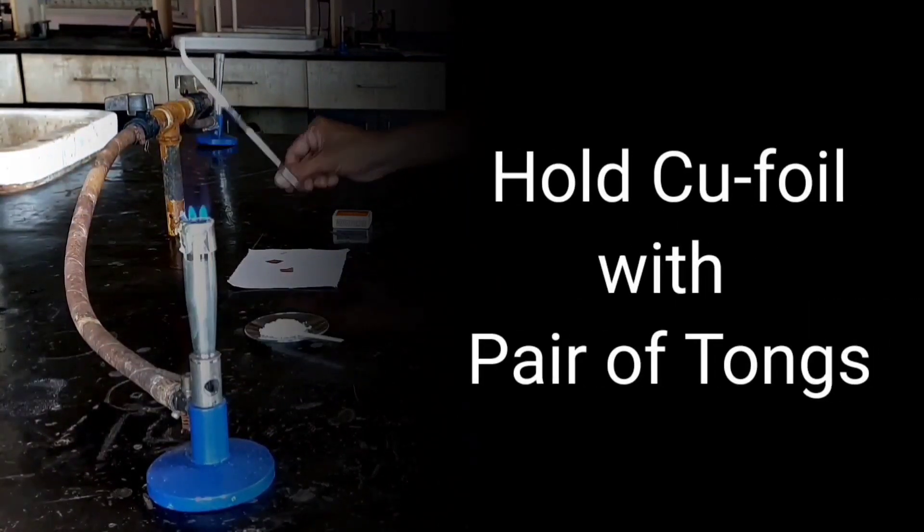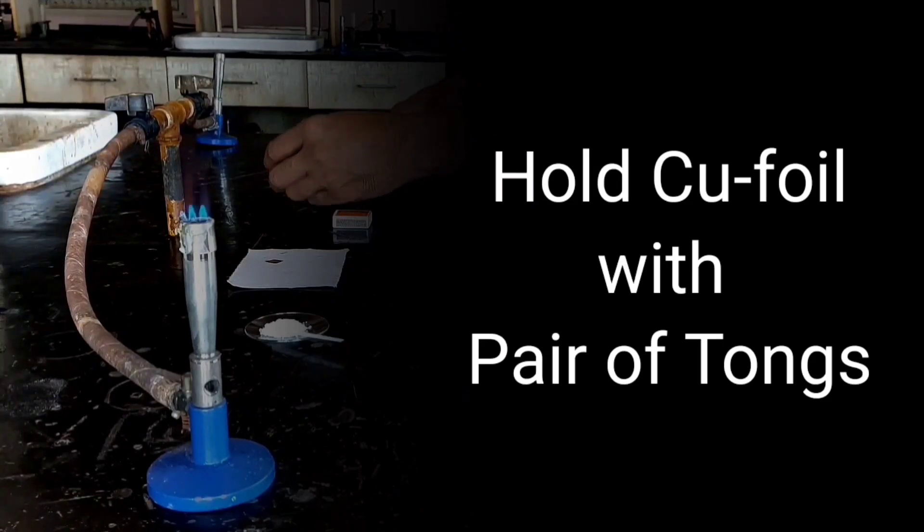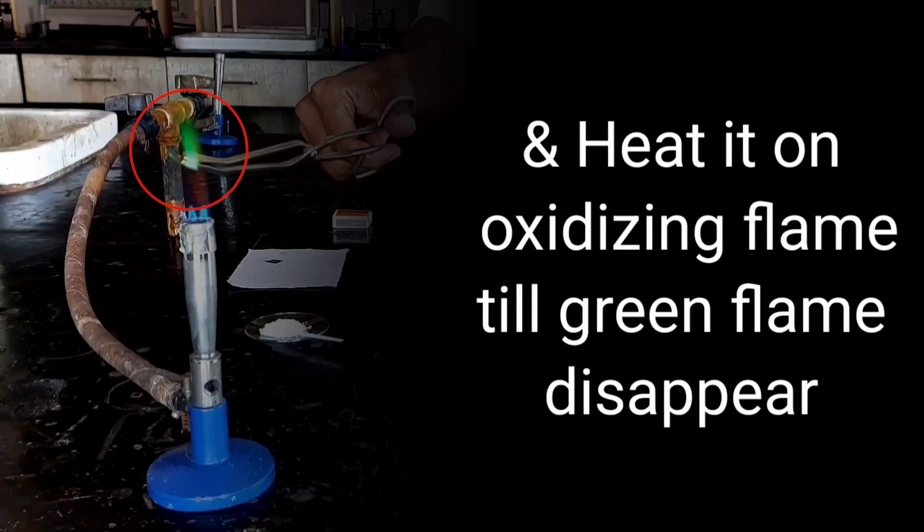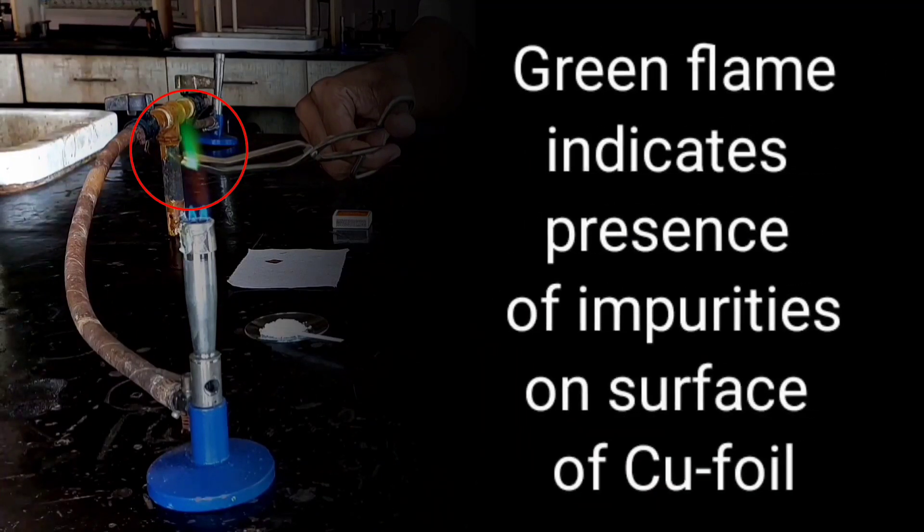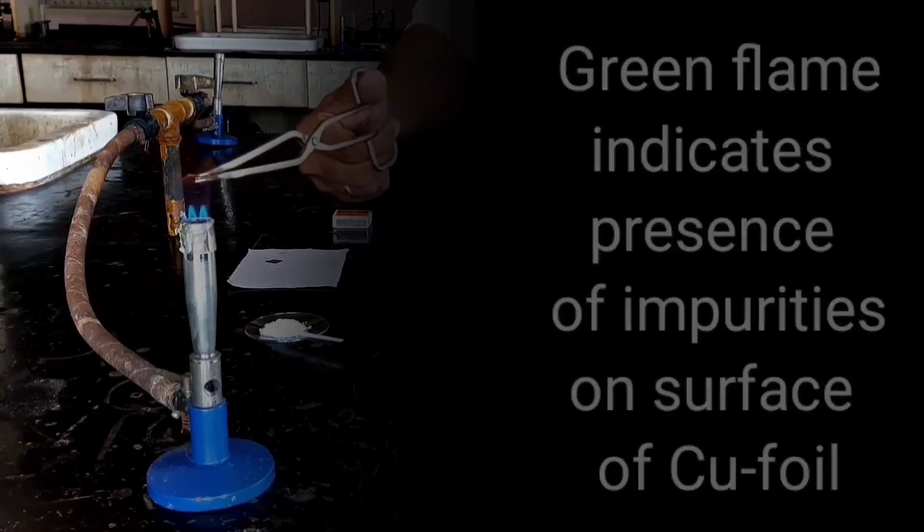Hold the copper foil with pair of tongs and heat it on oxidizing flame till green flame disappears. Green flame indicates presence of impurities on the surface of copper foil.